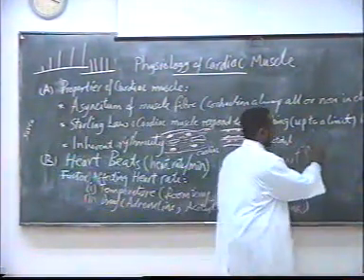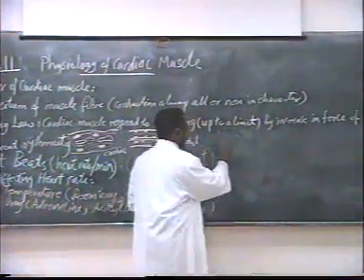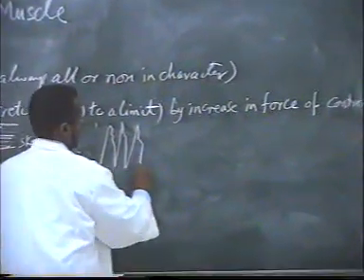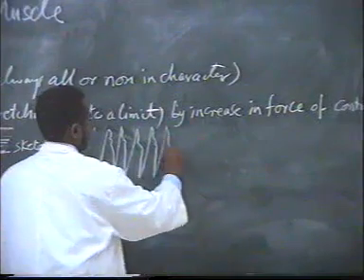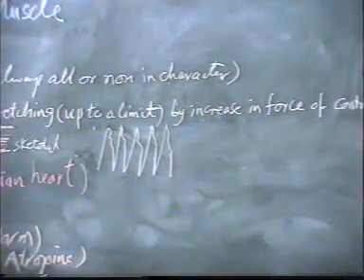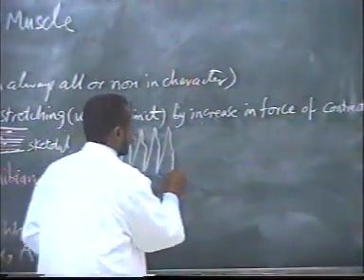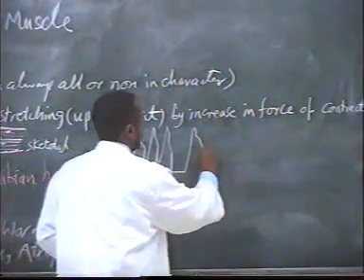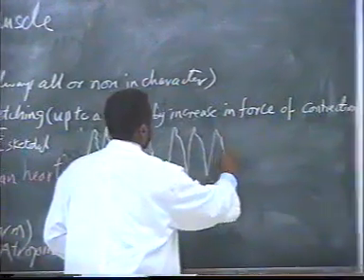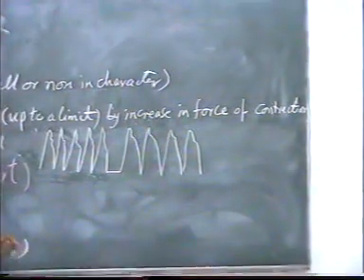For example, we usually start by recording the normal heartbeat at room temperature, which is, for example, like that. Then after that we add cold Ringer, and then we record the heartbeat. Then we add warm Ringer solution.